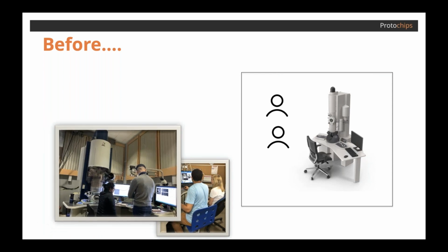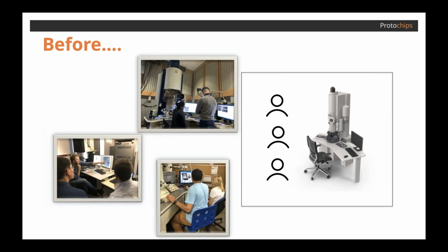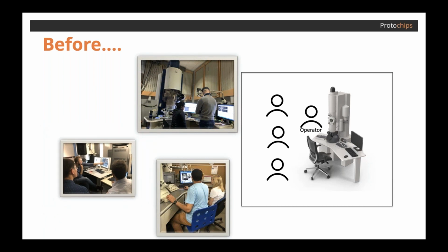As most of you know, it's absolutely more efficient to get together physically in person in the lab to exchange information. But unfortunately, this is not so easy anymore. Even for those who are just working down the hall from each other, it's still kind of difficult.